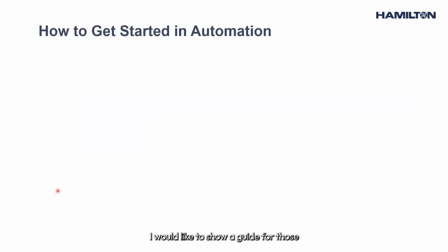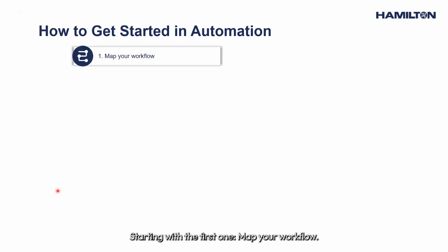I would like to show a guide for those who are thinking about getting started in automation. Starting with the first one, map your workflow.